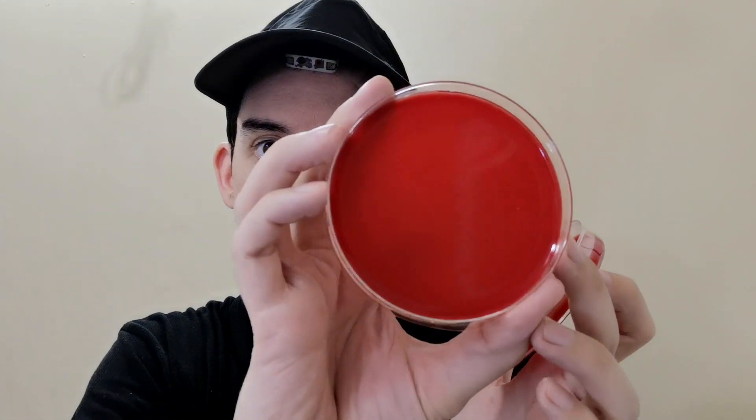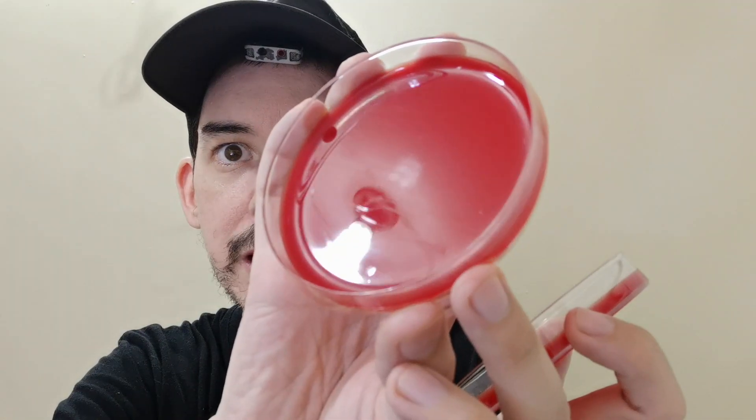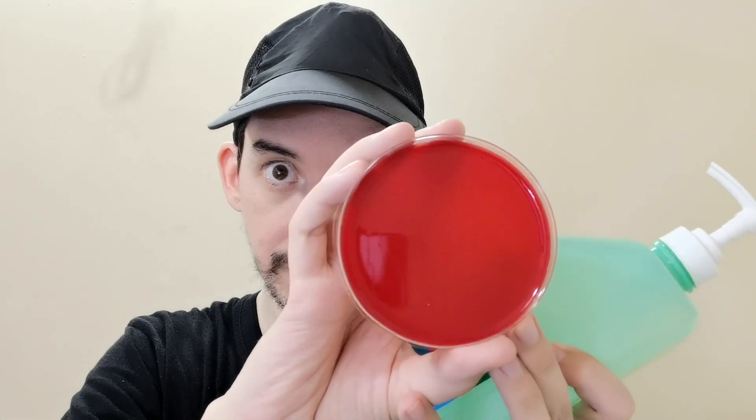And after 48 hours, this is how they look. This is our control sample where the phone had no treatment at all, and this is the one where the phone was treated with alcohol. You can still see the marks left from the swab, but there's no growth. So basically the answer is yes, it's effective. I wasn't sure if it would really give us 100% results like this, but in my test it worked very, very well.